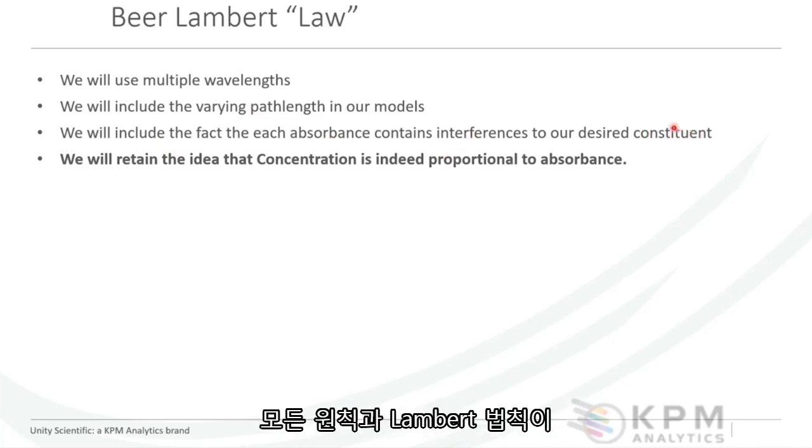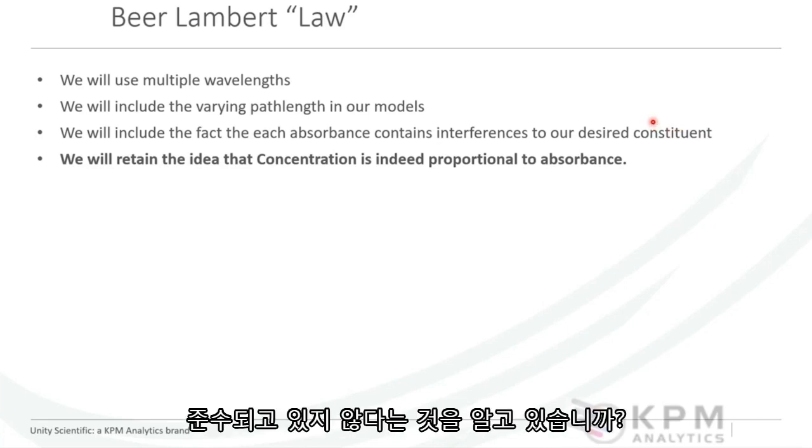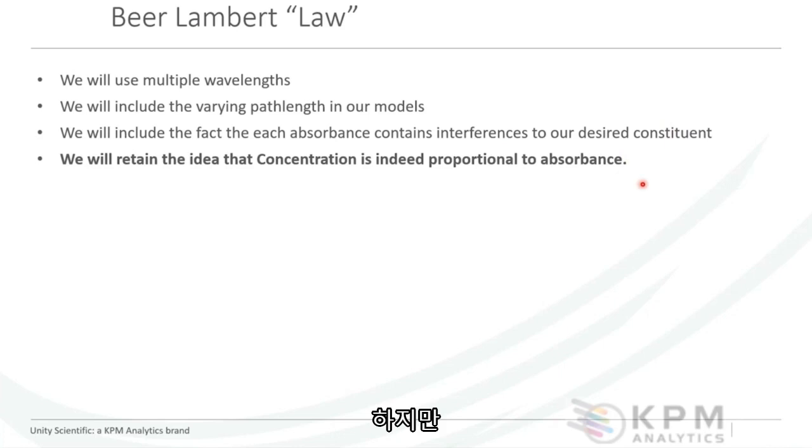So we know that not all of the principles of the Beer-Lambert law are being adhered to, but one thing that is true, and we will retain, and this is really the core of what we're doing, is the idea that concentration is indeed proportional to absorbance. And you'll find that it is. So this is the fundamental part of what we're going to be doing.